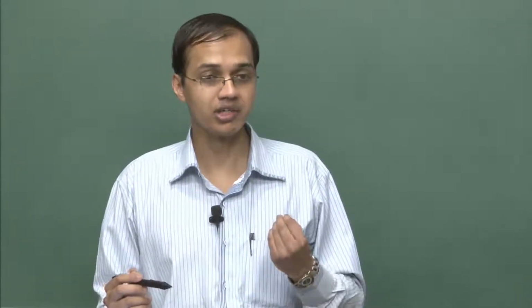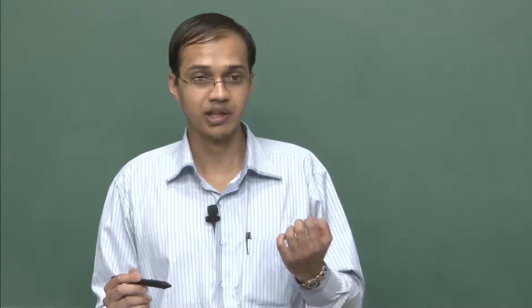Obviously, when we are studying a thin film or the nanoscopic deposited particles, we are more interested in these particles, and therefore we want the diffraction information from these particles. So we want to get maximum information from these particles.